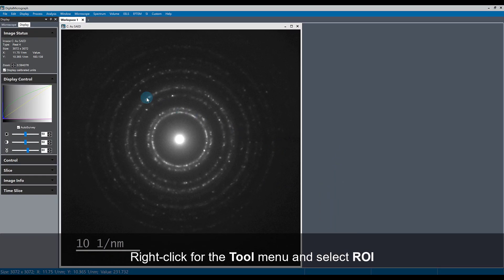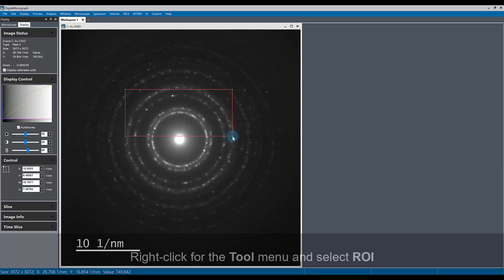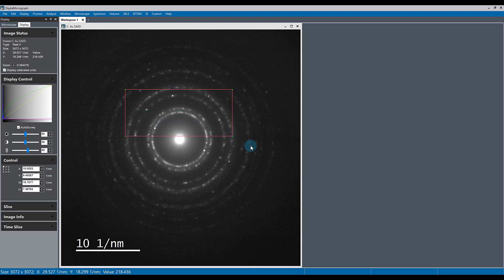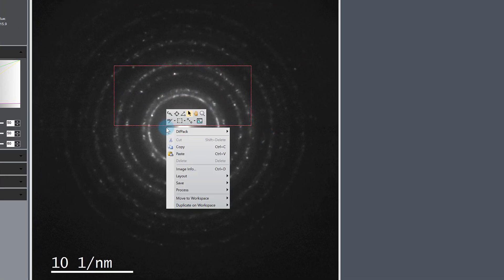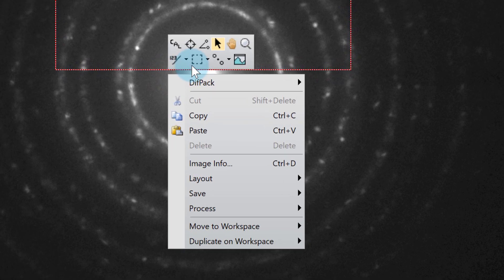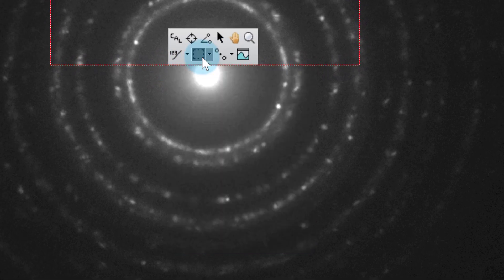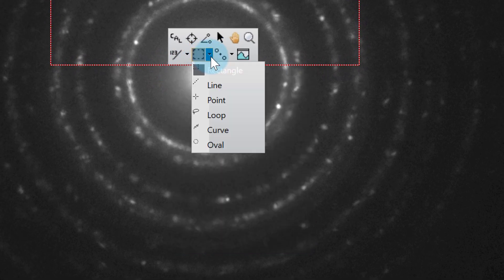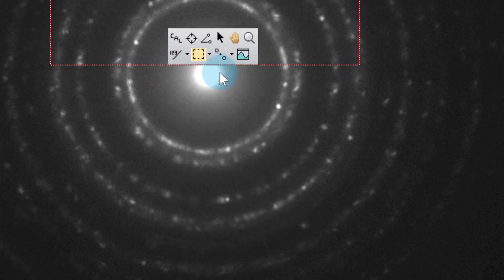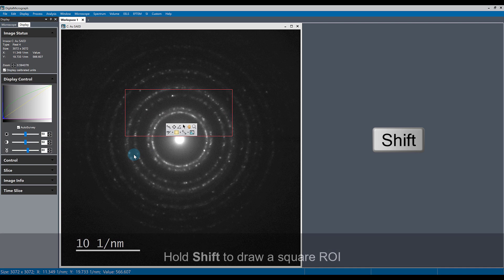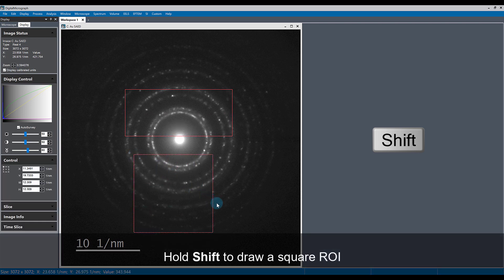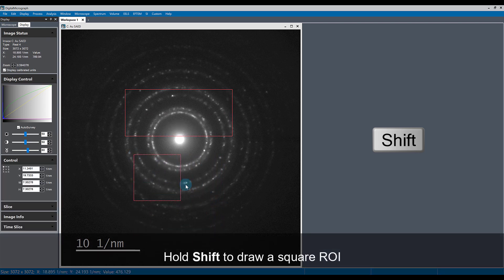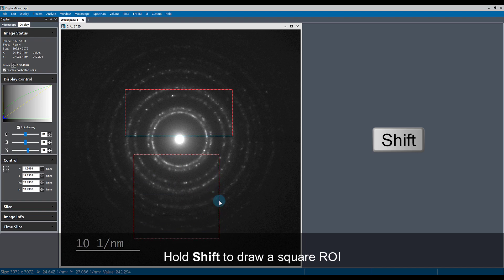You can easily draw a rectangle ROI, but if you want to draw a square ROI, select the rectangle ROI tool and hold the shift key while drawing to maintain a square aspect ratio of your region of interest.